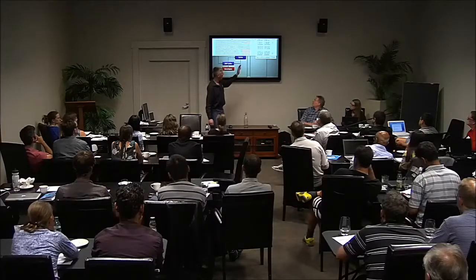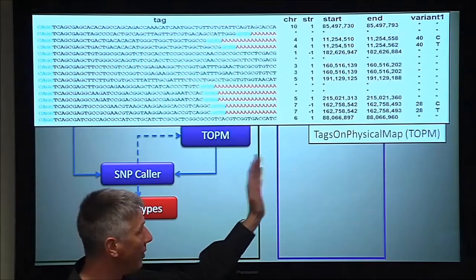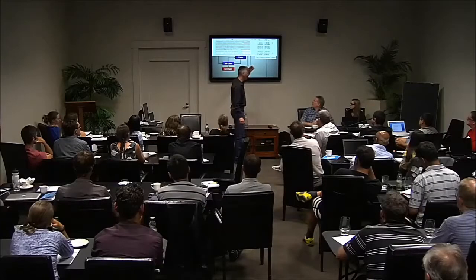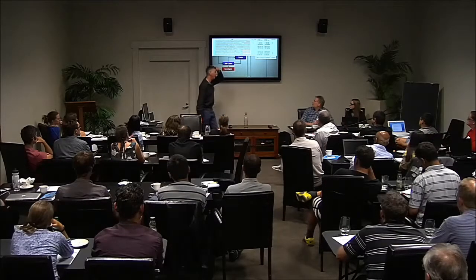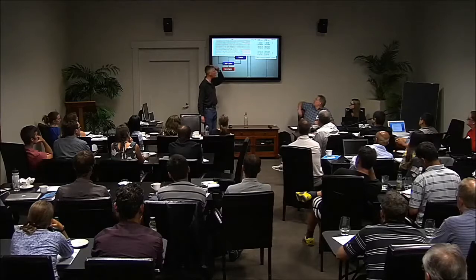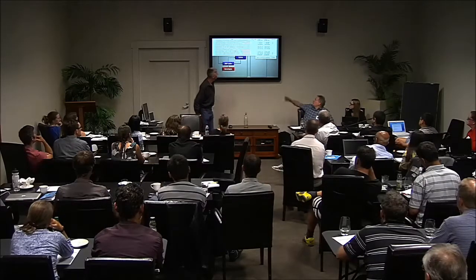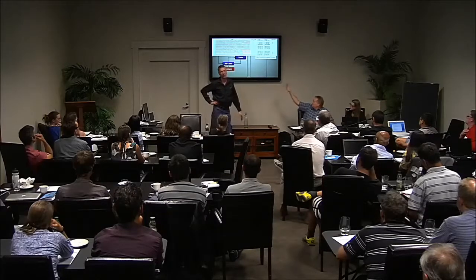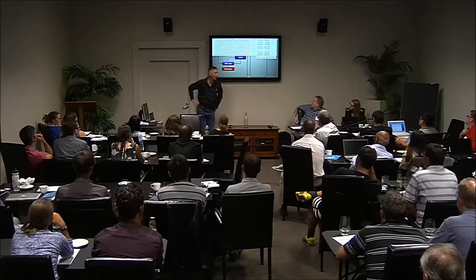And so at the moment, the limit of that, I haven't been around long enough. Does that change? Do we still only have 8? No, 16 is the default. 16 positions by default? Yeah. Okay. So this is only showing one variant, but we can store up to 16 variants per 64 base.